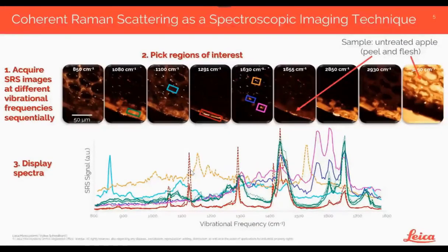And we have built in our software, we automatically switch between those cubes depending on the vibrational frequency that is chosen by the laser setting. So there's no need for a manual reconfiguration except for changing external cubes in front of the detectors directly. So that's the question concerning the cubes.